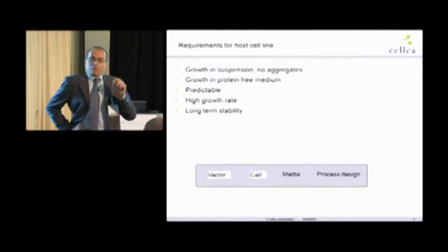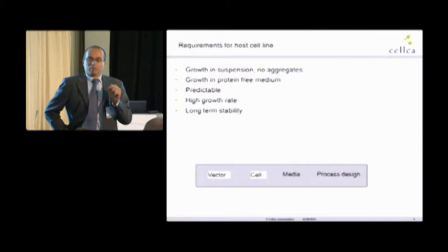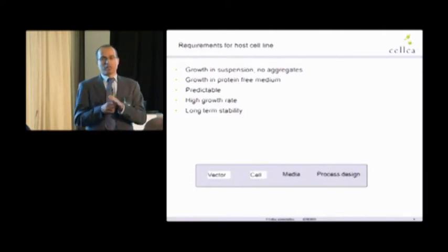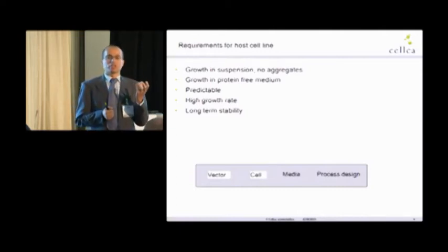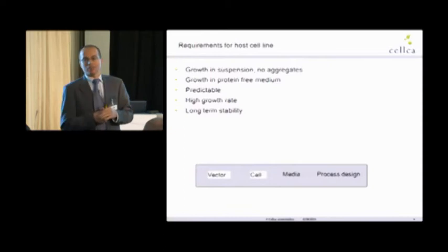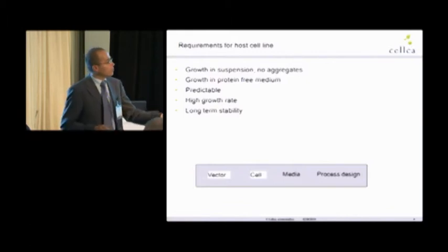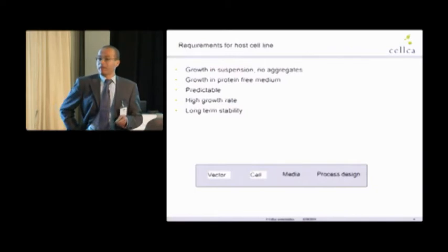And in small scale, we get more insulin in our culture medium because the filter didn't retain very much insulin, later on in 10,000 liter, we retain a lot of insulin by media filtration, and the cells produce small scale 2 gram and large scale 1.5 gram, we don't have a kLa problem.